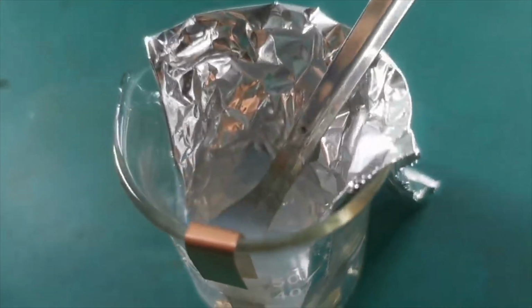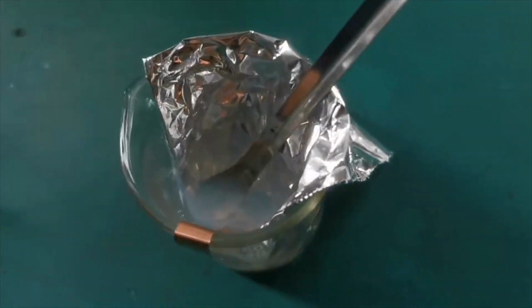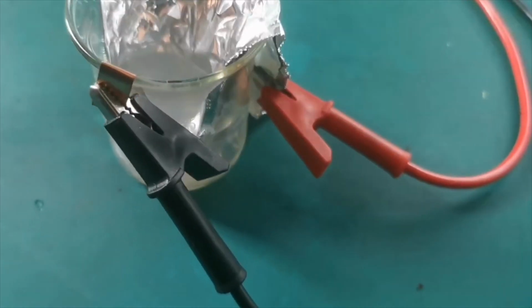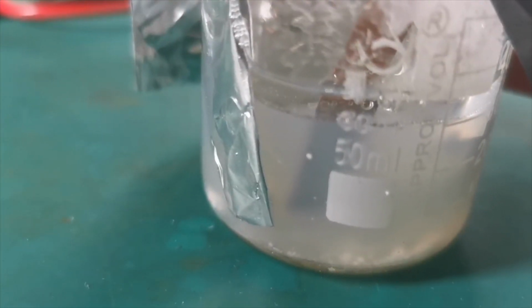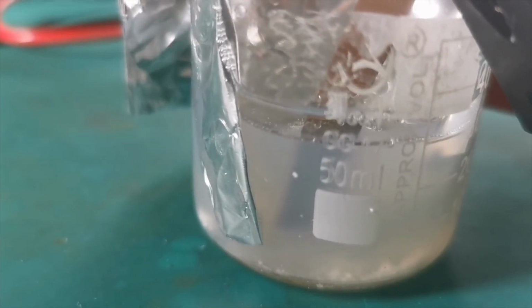Next, an aluminum foil anode and a copper sheet cathode are placed into the solution. The copper can be replaced with any common metal, but the aluminum cannot be replaced with inert anodes such as graphite, and I'll explain why in a moment. The alligator clips are connected and the 12-volt power supply switched on. You can see that the copper cathode immediately darkens and some bubbles are released.